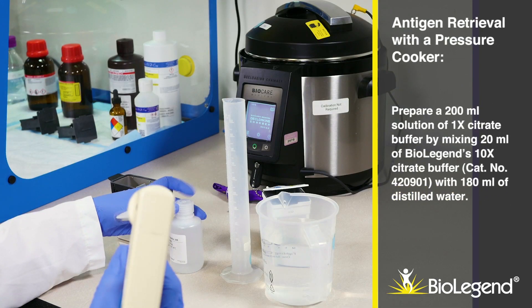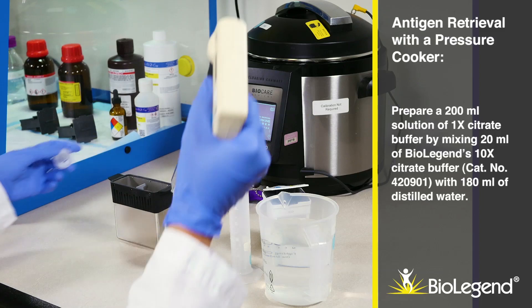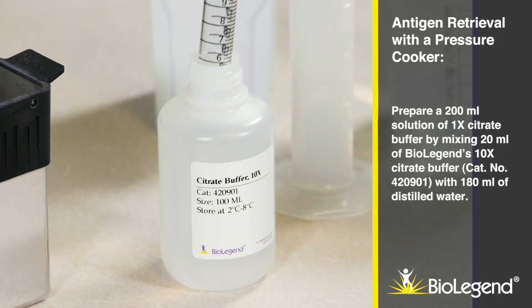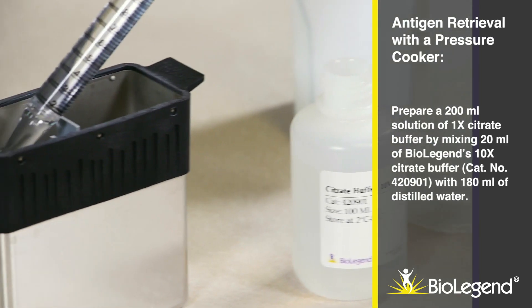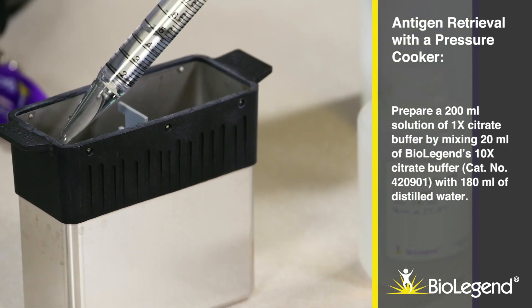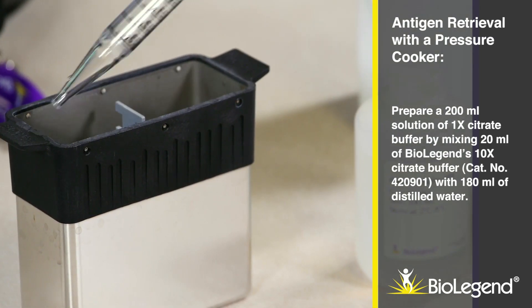For antigen retrieval with a pressure cooker, prepare a 200 ml solution of 1X citrate buffer by mixing 20 ml of BioLegend's 10X citrate buffer, catalog number 420901, with 180 ml of distilled water.